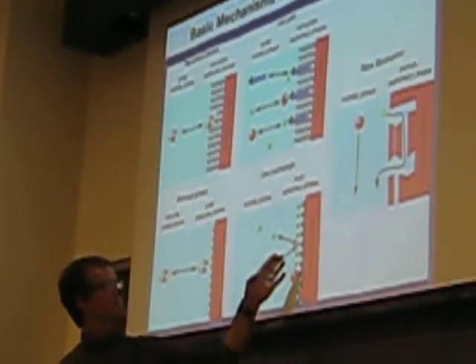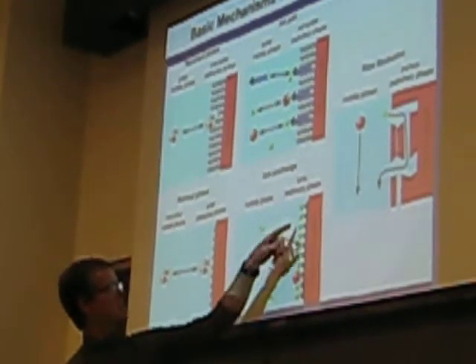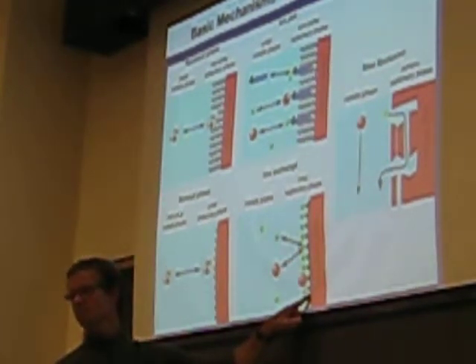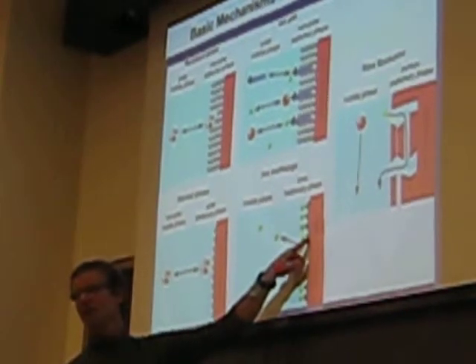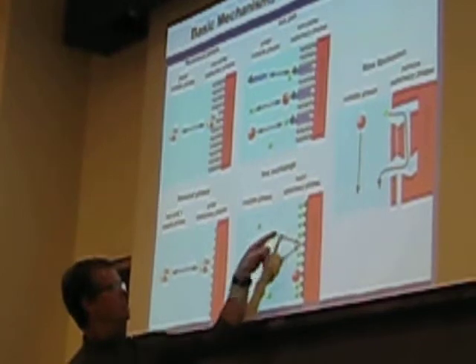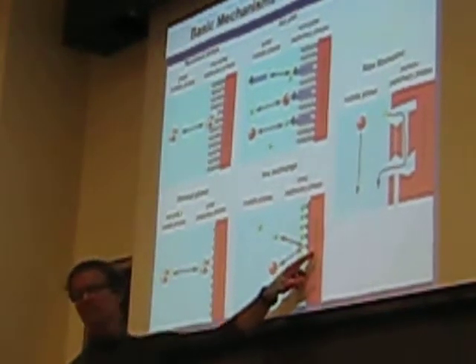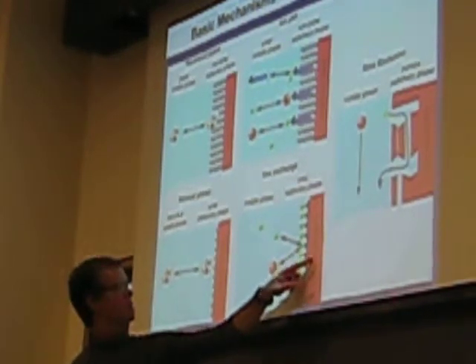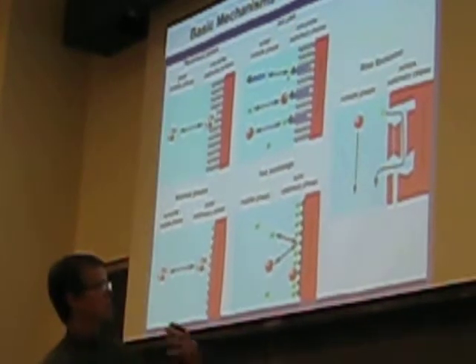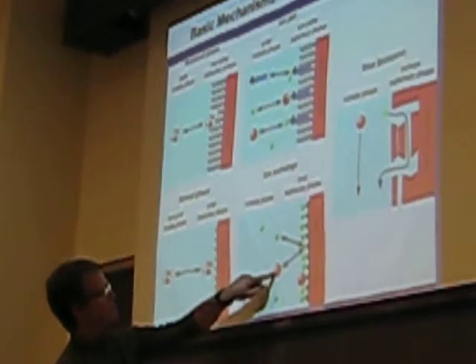Okay. It may be hard to tell because you can't tell what these are supposed to be, but the black is what's supposed to be the functionalized group on the stationary phase, and you see it's negative, right? If it's negative, that means it's attracting the opposite, and that would be the cation. So in this case, this is a cation exchange, ion chromatography, because the functional groups are the opposite of the cation in order to attract it. And here, sorry, maybe you're supposed to be mobile phase. Here's the anion, but still it's positive.